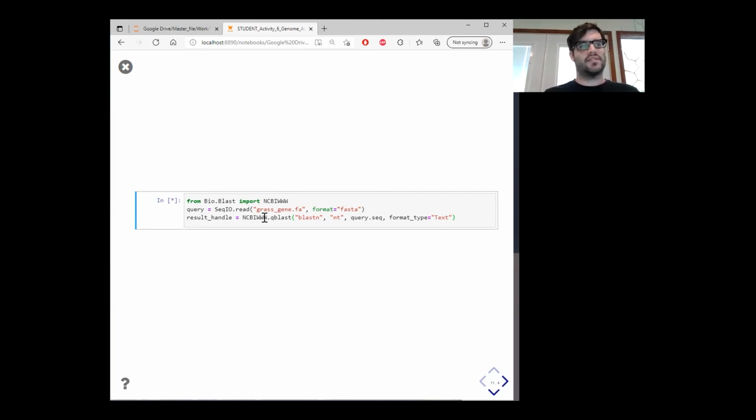And so if you're running a single gene like we are, this could take 30 seconds to maybe 5 minutes or so. If you were to run an entire chromosome, it could take days or weeks. There are better programs that you can use for larger scale things like that. Or instead of a single gene, you can parse a file with hundreds or thousands of genes and run it against here. But just remember, the more genes you provide, the more sequences, the larger the sequences, the more time it will take. And so that took about a minute, and let's see what it output.